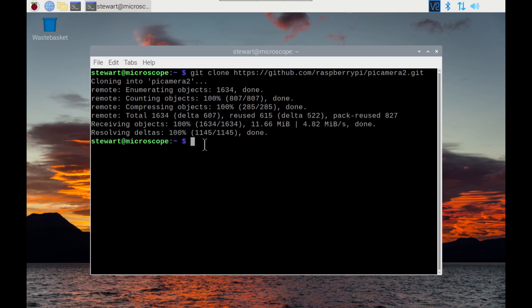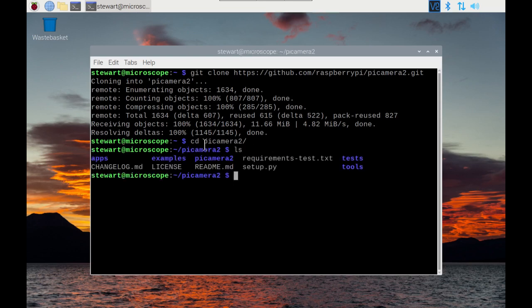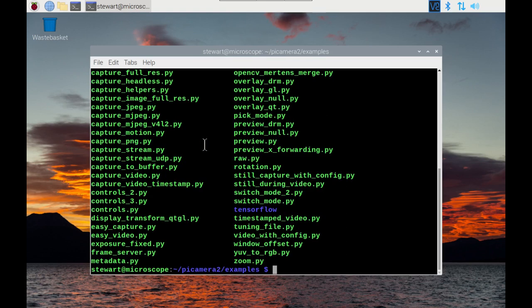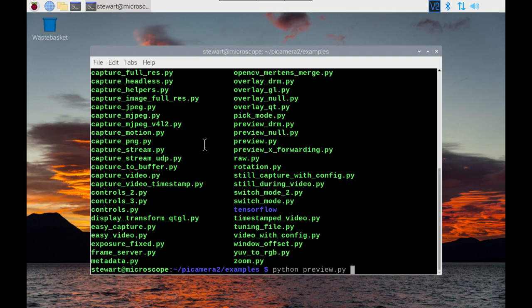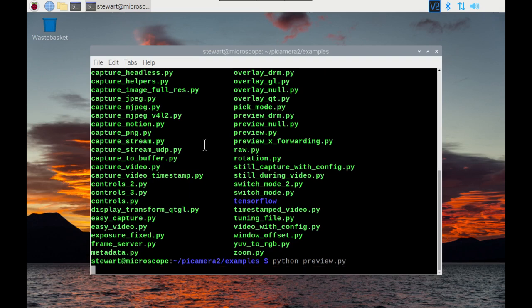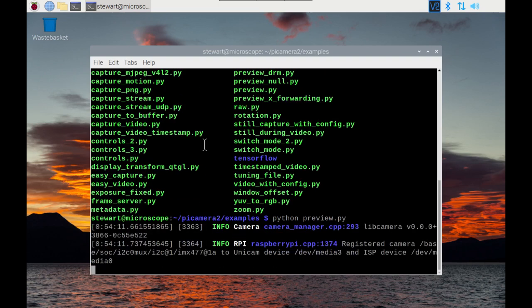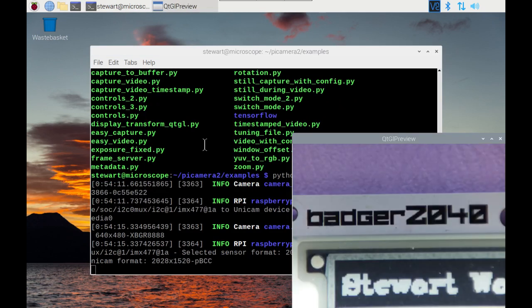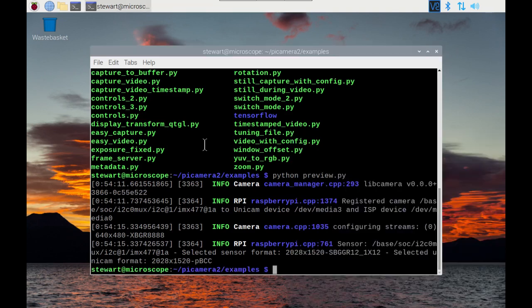We can change to Pi Camera 2 and have a quick look. You'll see there's an examples folder and there's various programs in here. One of the things we can do is run Python preview.py and that will give us a preview. There we go, so it's running that okay.